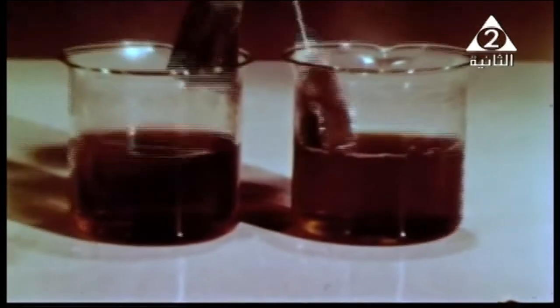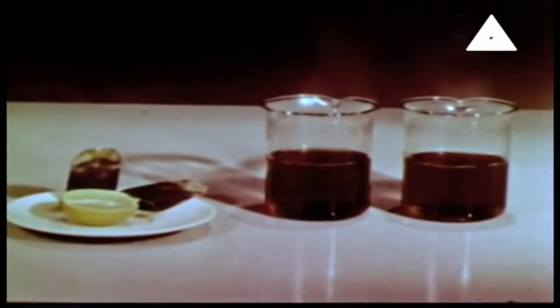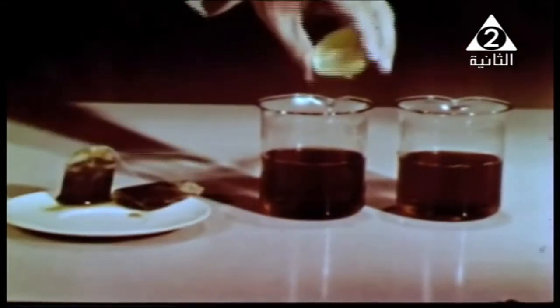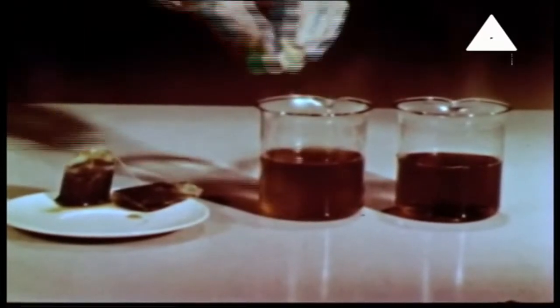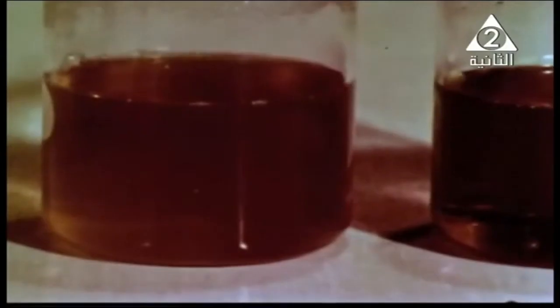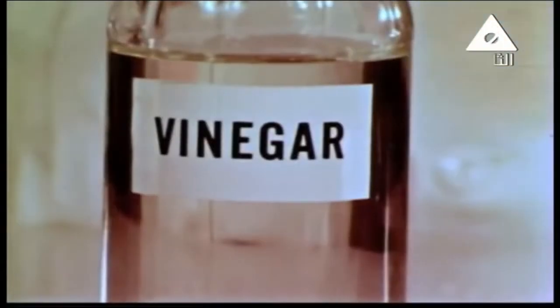We have here different solutions. I want to know what is the acid, what is the base for each one. When I get lemon, you remember? Lemon here is what? Acid? Yes. Concentrate here. The color, is it change?